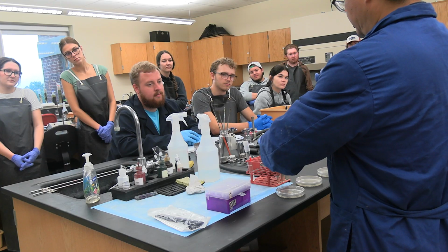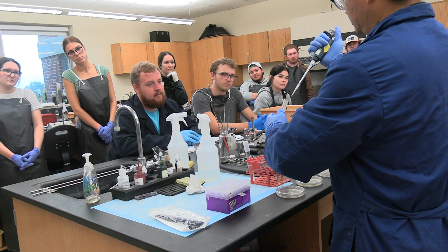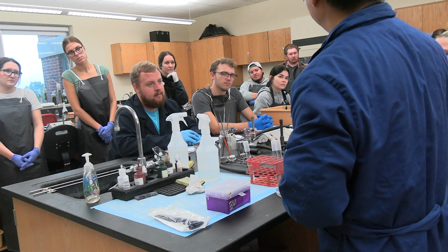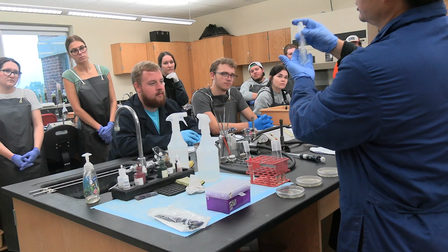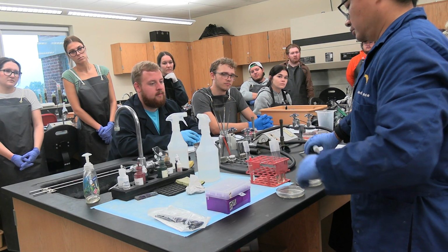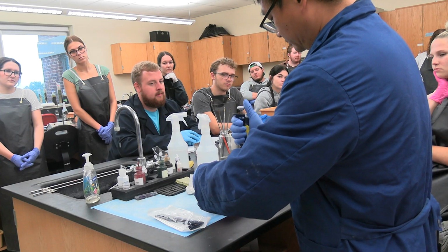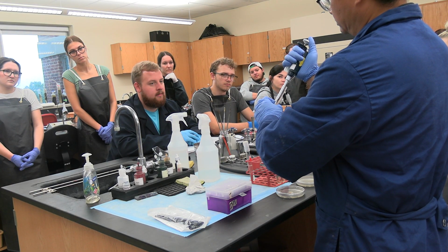Let's go from this direction. This, you have to switch the tips. So put it here. Shake 15 seconds. Putting a second row, so that means it's finished. Then you take it out.